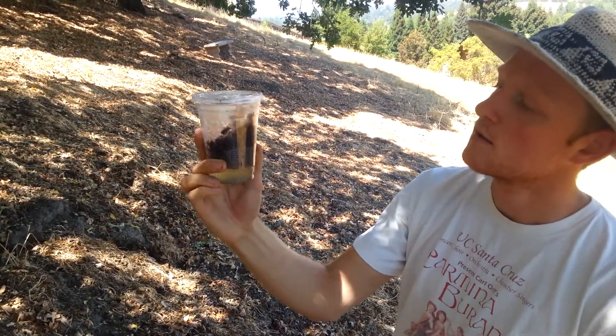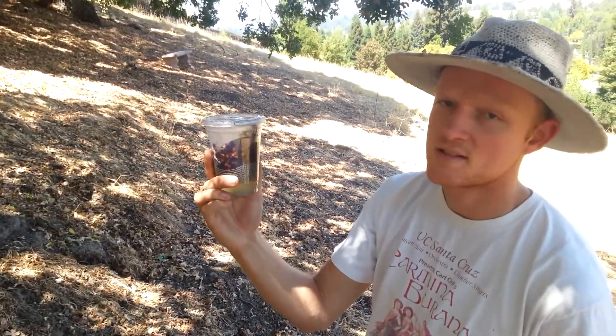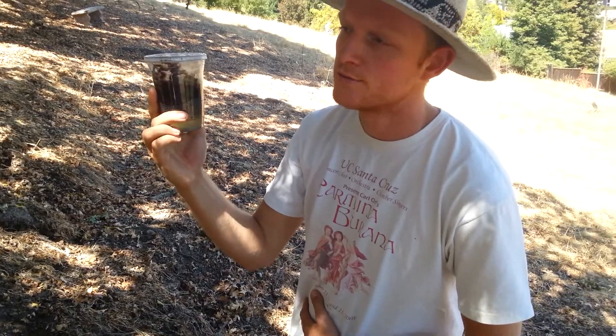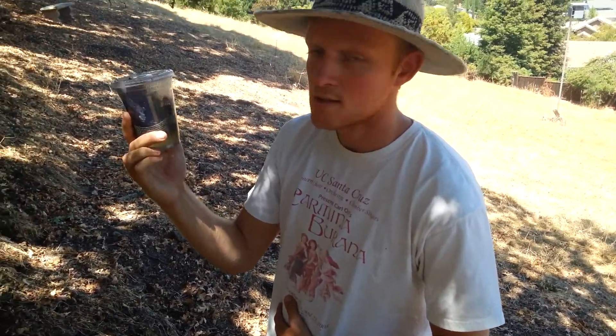So now by agitating this alcohol wash, it killed all the bees — but it's just like taking a blood sample. 300 bees out of a hive of 11,000 minimum, up to 60,000. It's just like a blood sample.